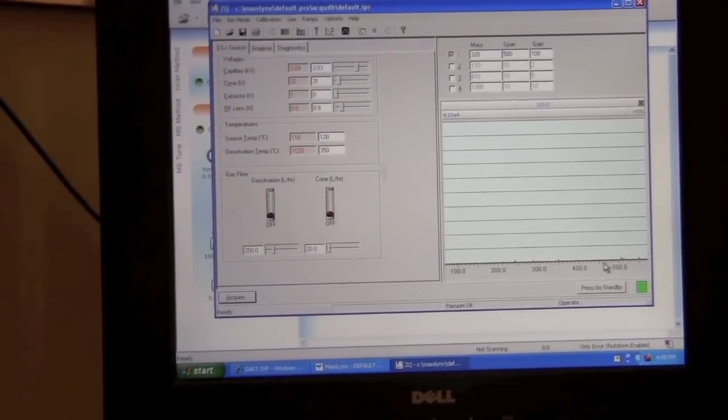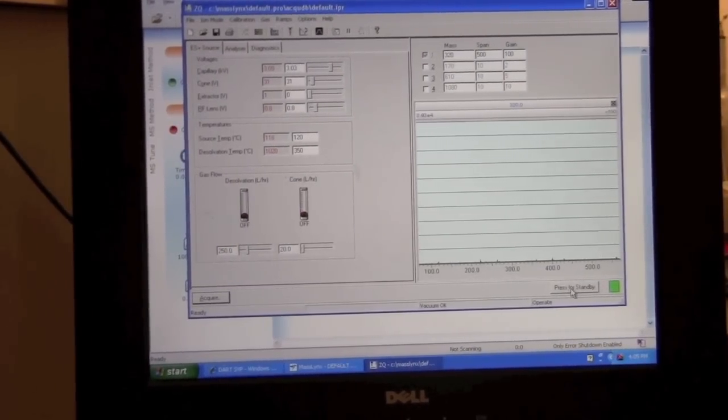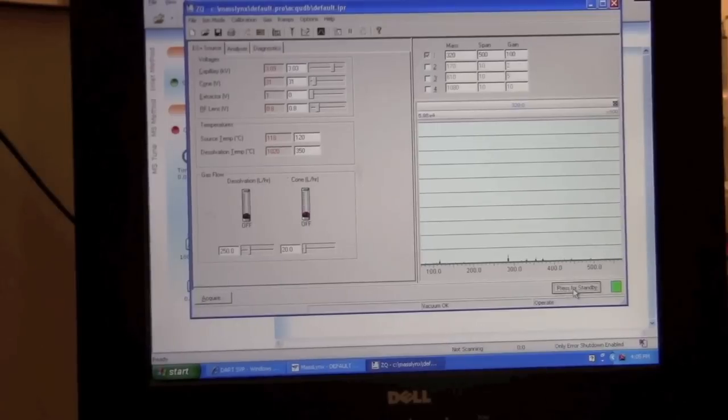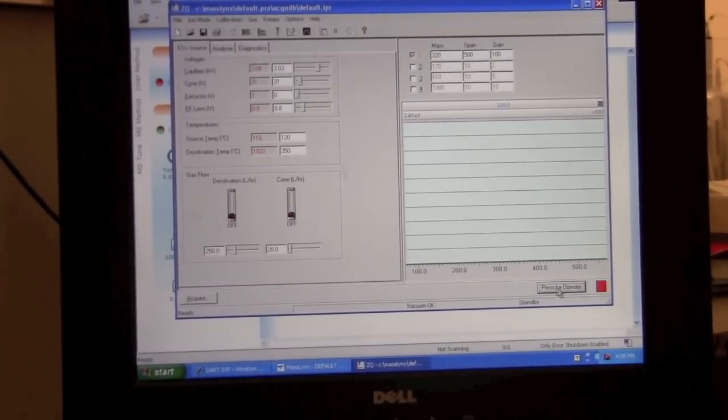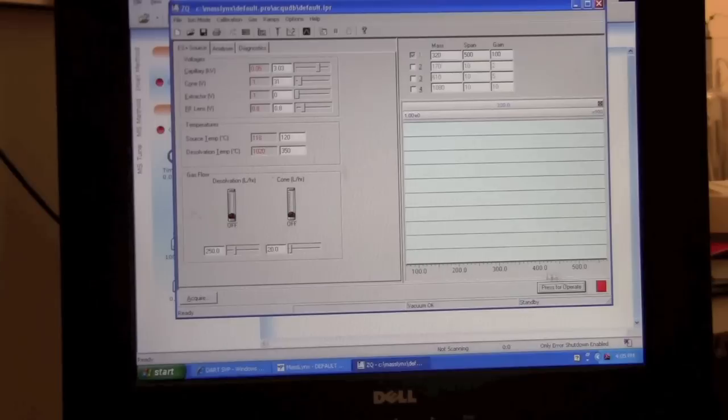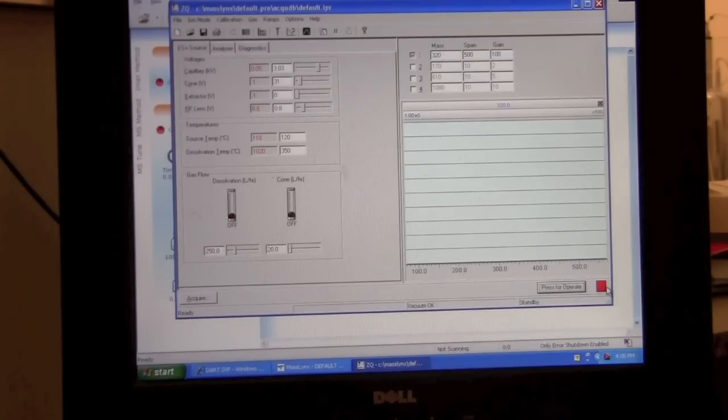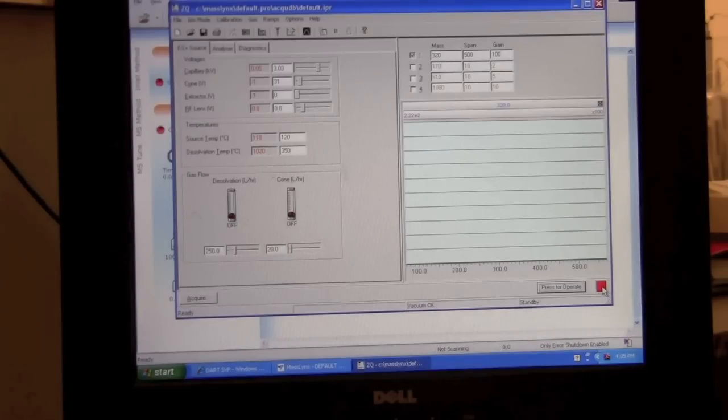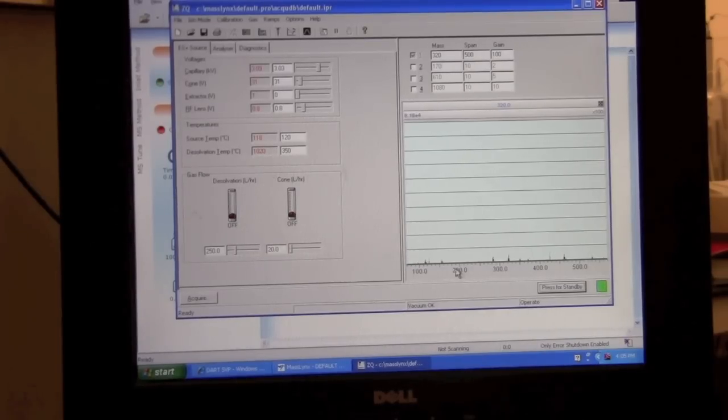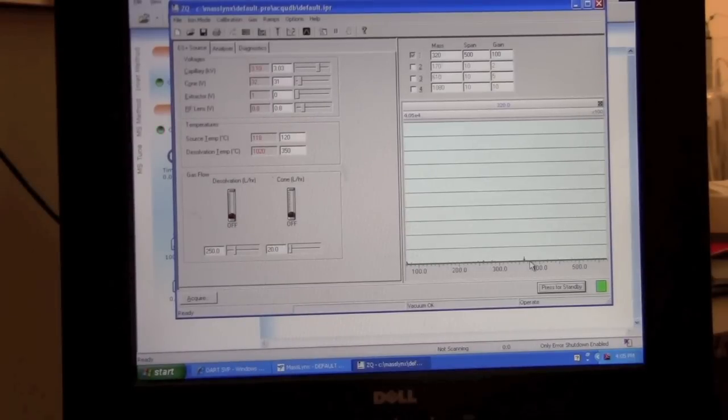If the mass spectrometer is not already operating you want to click this button to put the mass spectrometer in operation mode. If it's red it's not operating. If we start it operating the light should be green and we may see some ions in the mass spectrometer.